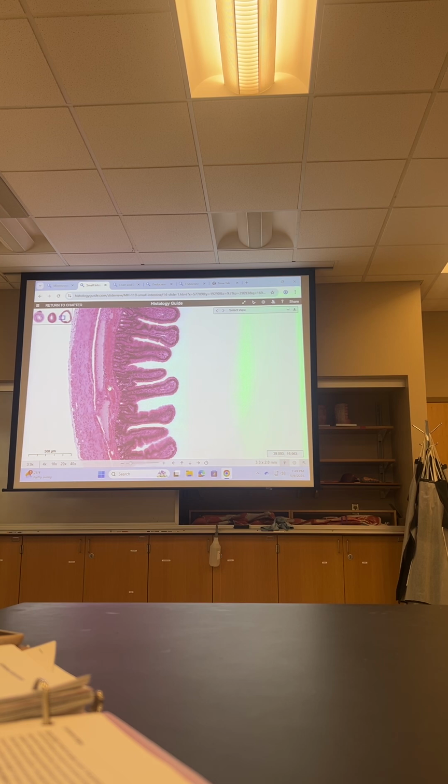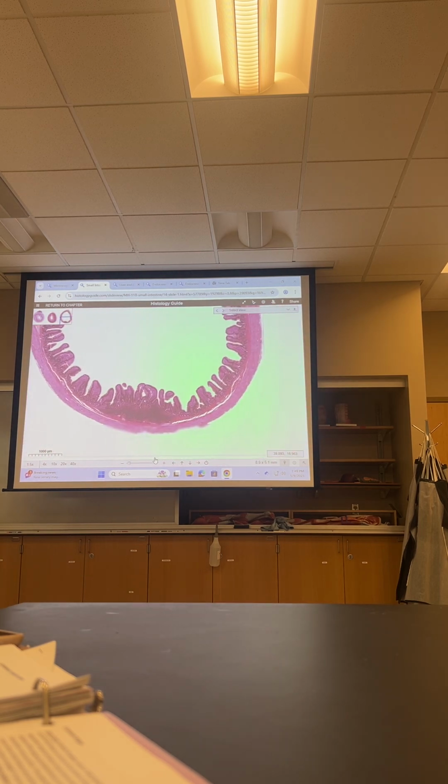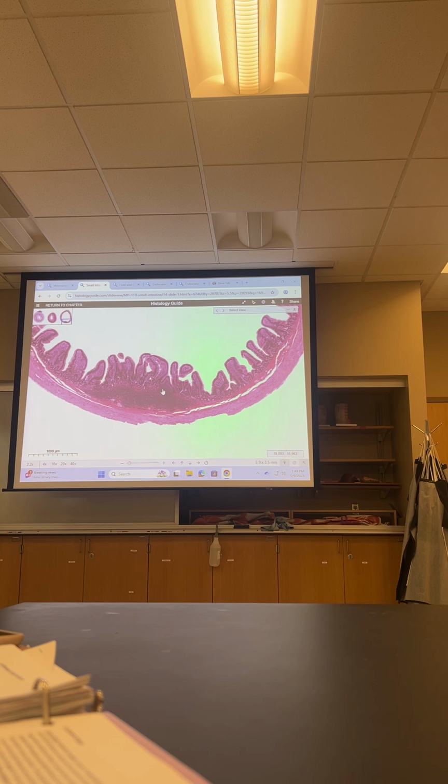Again, when we get down here to the submucosa, there are no glands, like the duodenum. However, you will be able to find what are called Peyer's patches, which are large regions of lymph tissue. Remember, lymph tissue appears as dark purple when you're looking in there. And so that's how you're going to be able to tell that it's the ileum, because if there are Peyer's patches, then you're in the ileum.